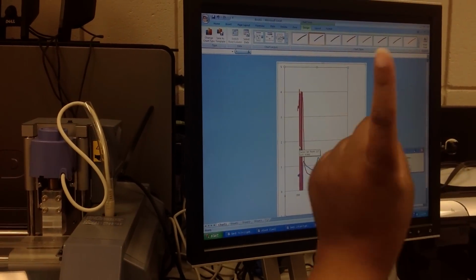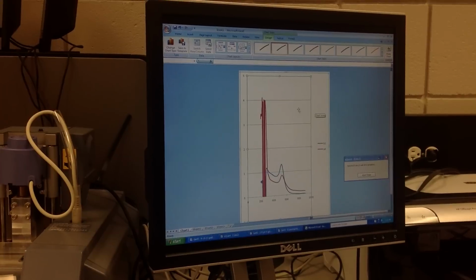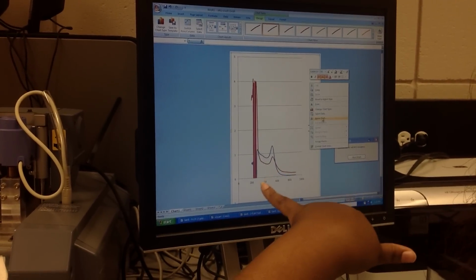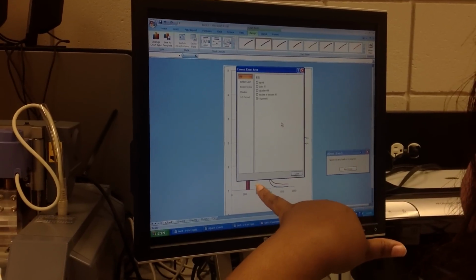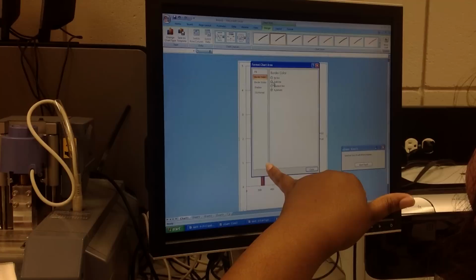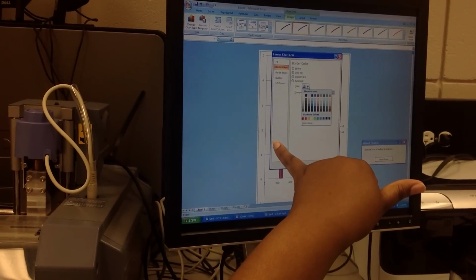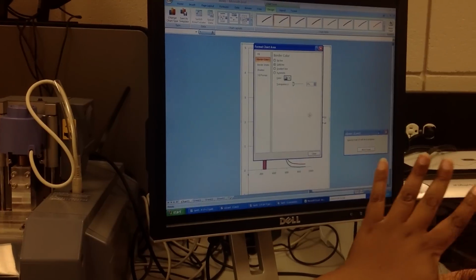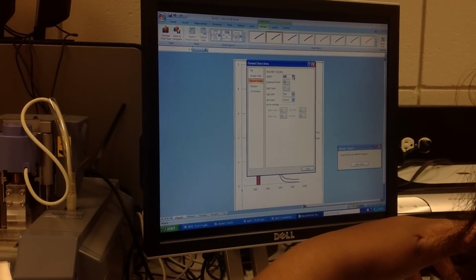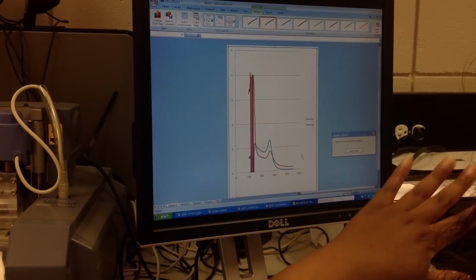And the way to format your Excel charts so they look good in a presentation is to right click here and do format chart area. You're going to have no fill. You're going to have a solid black line for a border, a nice black or something like that, probably about a point. No dash, okay, and that's cool.